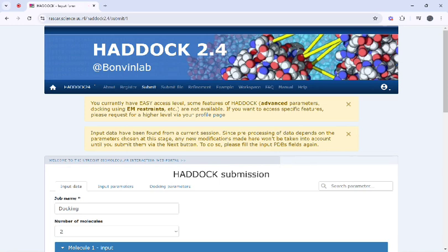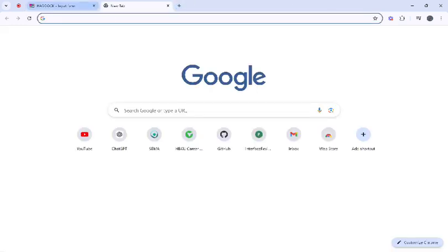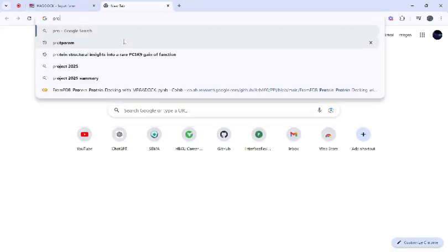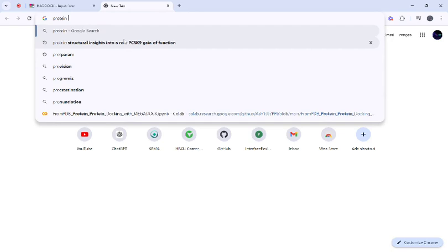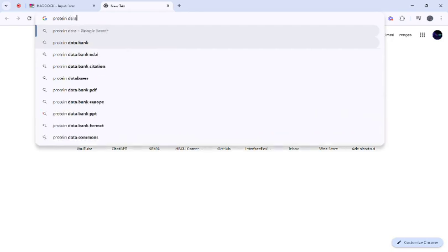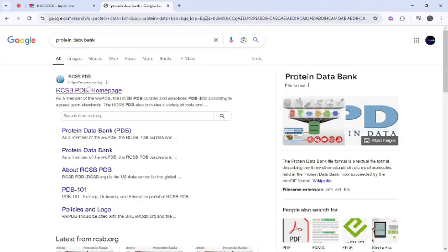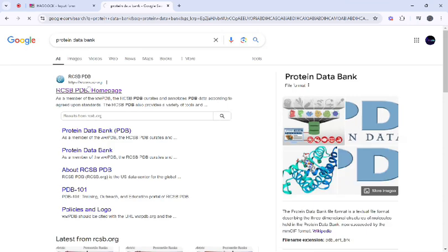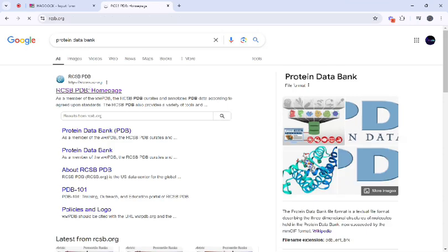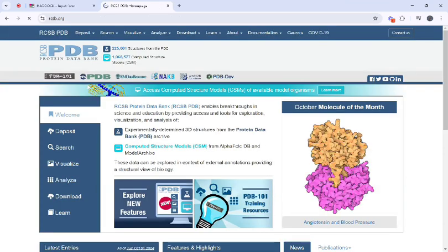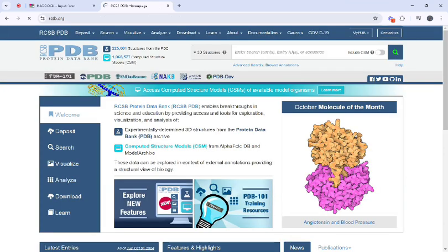First we need our protein structure. You can download the protein structure from the Protein Data Bank. From this website you can download protein structures.